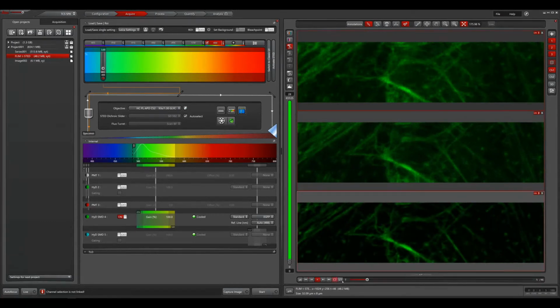So let's just go through the time series here now and see how our HeLa cell is actually moving over time. And now we really have an additional information which classically with STED microscopy was challenging to achieve. Getting a good resolution improvement on a fixed sample is something that you can easily get with the appropriate settings and labelings in STED microscopy. However, to also get dynamics at this high temporal resolution, 1 frame per second, has been really challenging in the past. But this is something that we can now really use and investigate with when we talk about Tau STED.